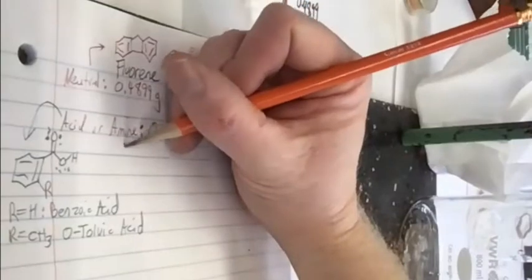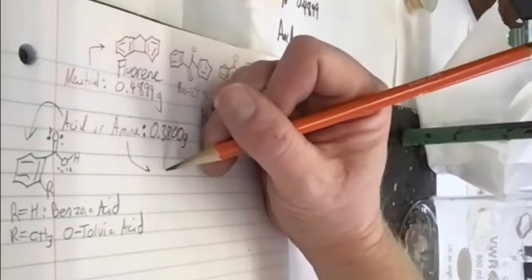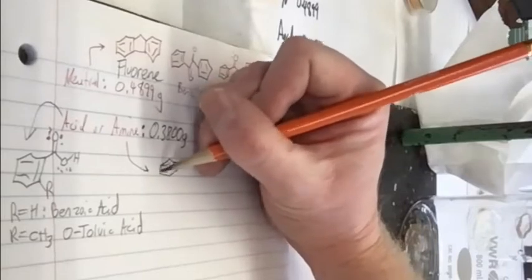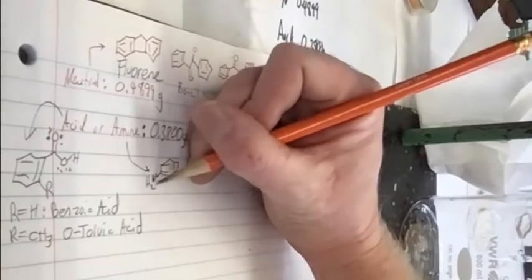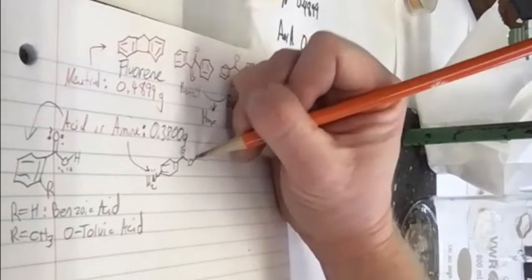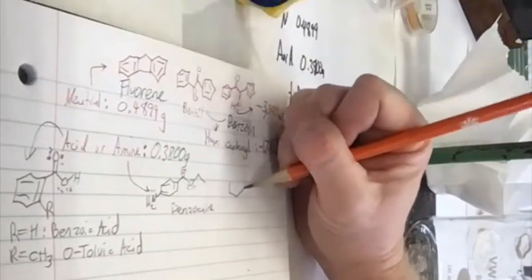And then our amine is either going to be benzocaine, which we had last time, the numbing agent, ethyl 4-aminobenzoate, or 1-naphthylamine. So we either have an amine, one of these two amines, or an acid, one of the two acids. We only have one of those four.